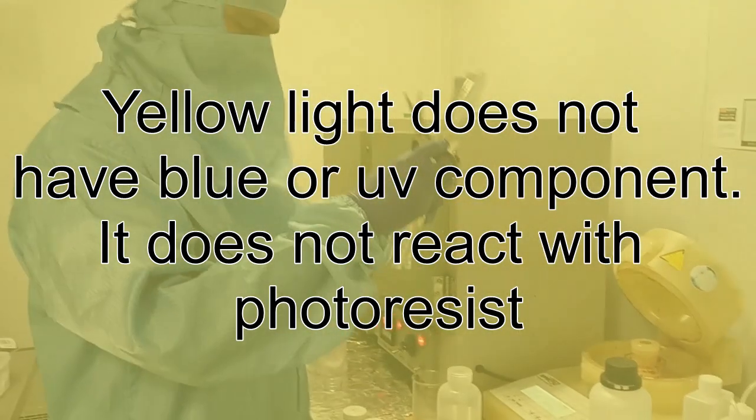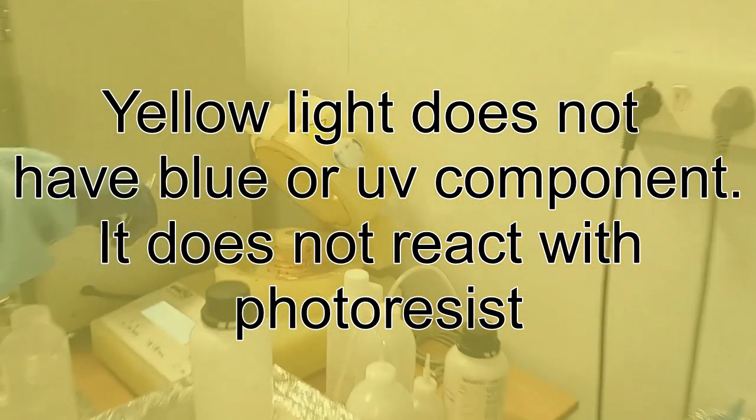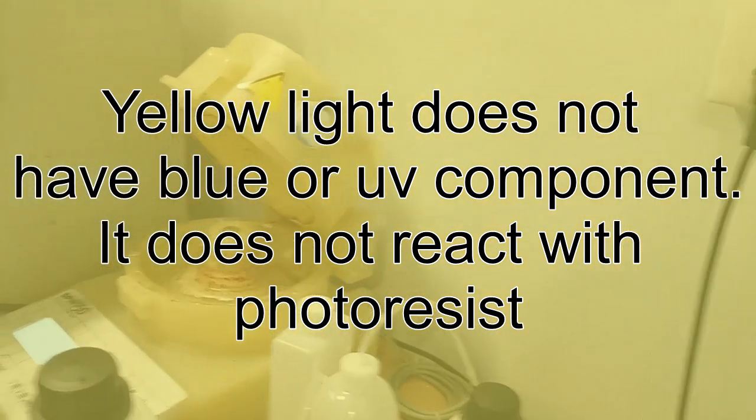What is it you are doing? I am just covering the place because photoresist will be coming out.